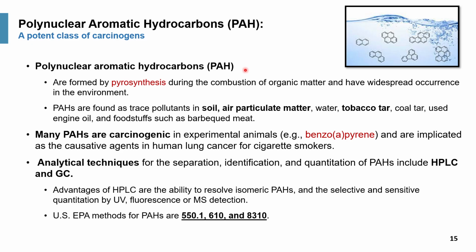Let me show you a little about the background on PAHs. It also turned out to be my graduate thesis. I worked on HPLC of PAHs and published a paper early on in Analytical Chemistry in 1975. So I started my career developing methods for PAHs, something pretty dear to my heart.